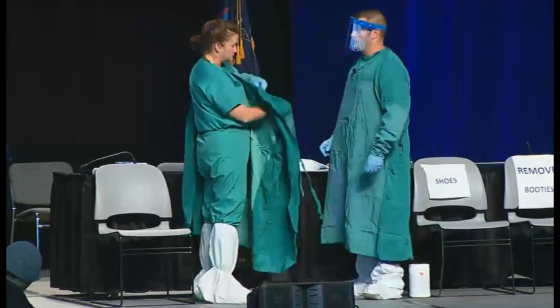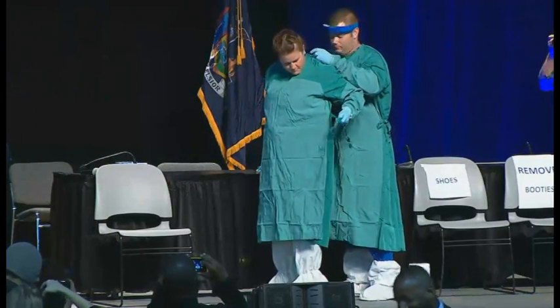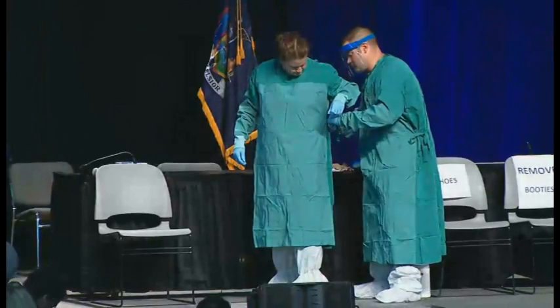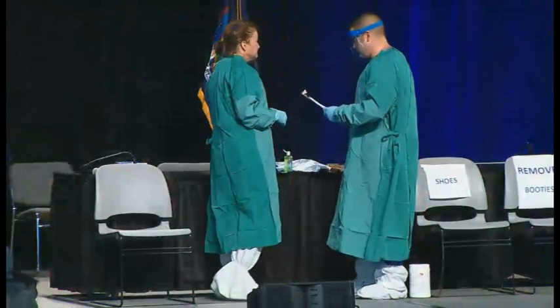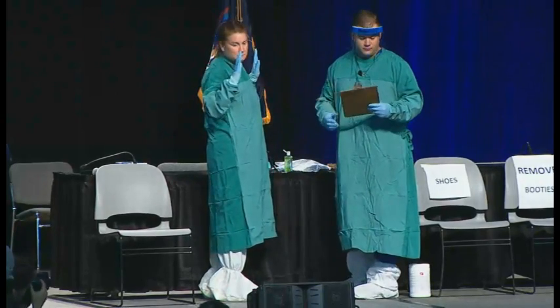You'll be identifying the healthcare personnel who are going to be providing the care and doing the evaluations. Know what sizes those folks wear so that your clean supply area is stocked with the right sizes for that small team. The trained observer's role is both to observe and make sure that the steps are being followed correctly, but also to help — some of this putting on and taking off could require a little bit of help — so that everything is done correctly.